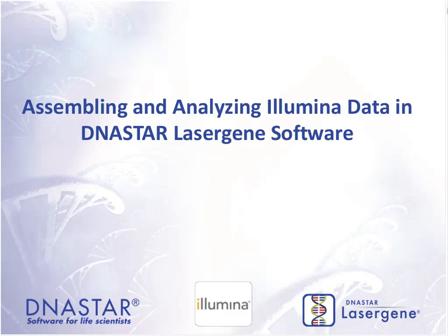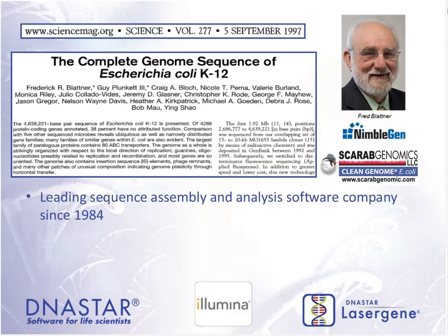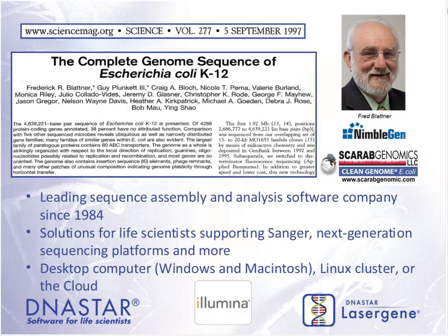So DNAStar has been a player in bioinformatics software for over 25 years. Our founder is Dr. Fred Blattner, who back in the 1990s first sequenced the E. coli genome. Some of the scientists that worked with Fred on this genomic project are still with DNAStar, so we have long-standing expertise in developing software for sequence assembly and analysis.